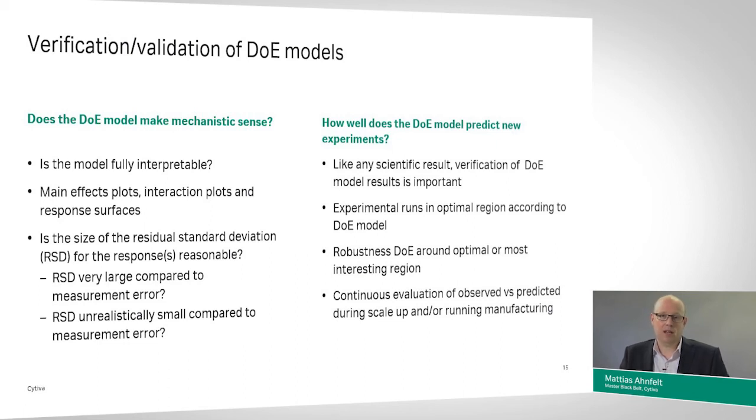It can be predicting the next level, scale-up to the pilot scale. Can our optimized lab model successfully predict the next scale? Fingers crossed it will be able to do that. And typically, if care and caution is taken, it does work extremely well, especially in chromatography, which is so beautifully scalable. And of course, that validation and verification of a DOE model is very strong evidence that we have a sound and working DOE model.